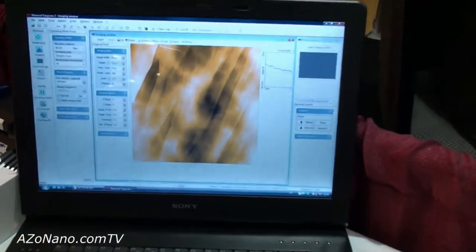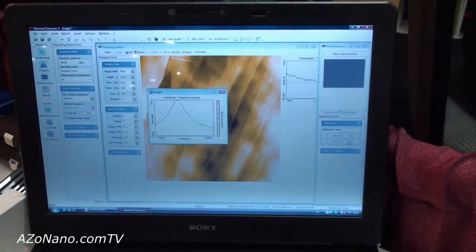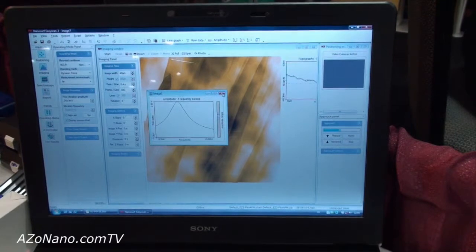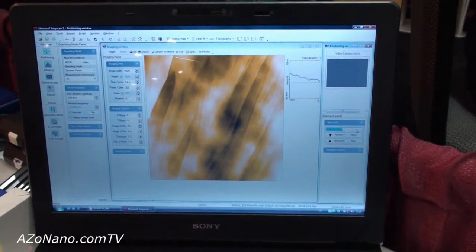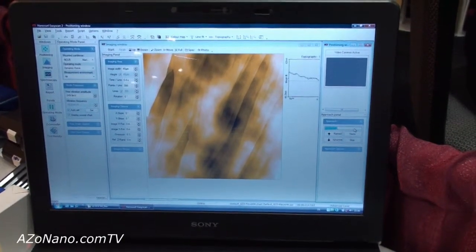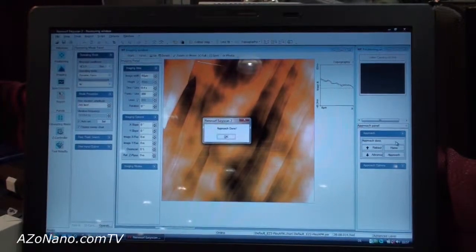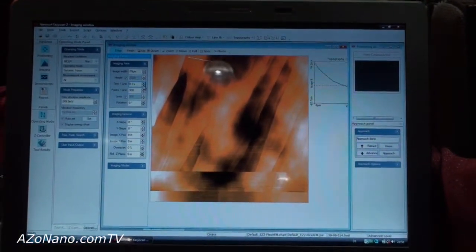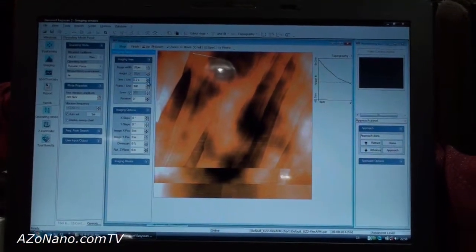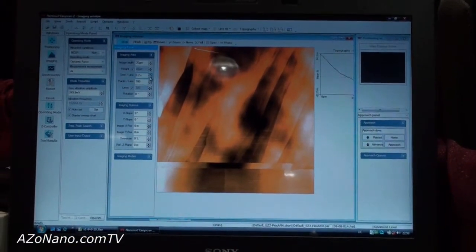Once the sample is loaded, it's as easy as setting the instrument to Auto-Approach. Then we start taking measurements of the sample surface, and that's all there is to taking measurements using the EZscan 2 Flex AFM from NanoSurf.